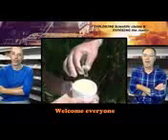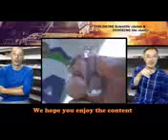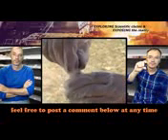Using the smaller vial, fill it with water all the way to the top, so there is no air left in it. Drop 2 dissolved oxygen tablets from the blister pack marked DO into the test kit and screw on the cap. If your vial is filled properly, some water will overflow as you do this. Now gently turn the vial end to end for several minutes to dissolve the tablets. Do not shake it. Once the tablets have dissolved, wait 5 minutes for the color to develop.